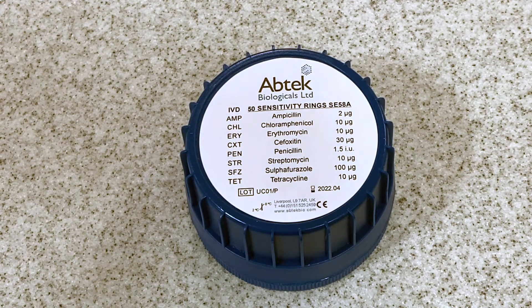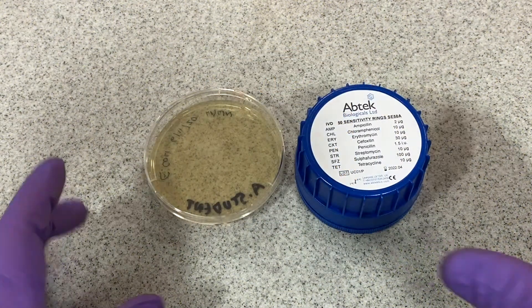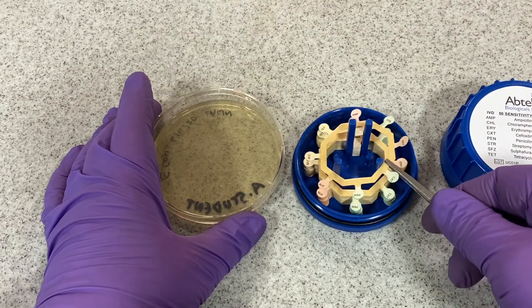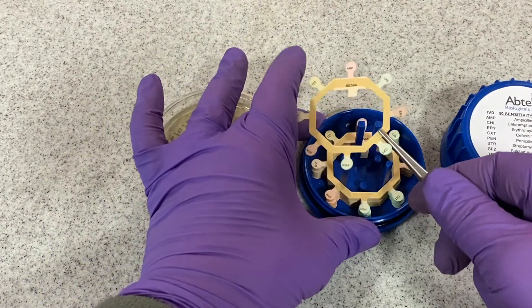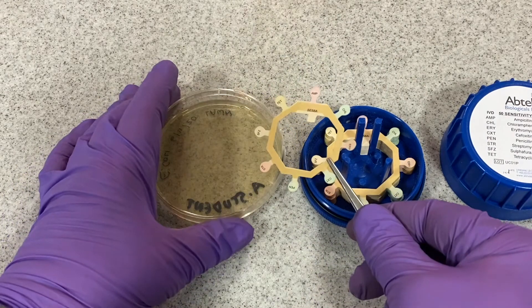A ring of antibiotic discs is used in conjunction with the lawn plate to assess the effectiveness of each antibiotic. This is calculated by measuring the zone of inhibition of growth of the bacteria around each antibiotic sample.